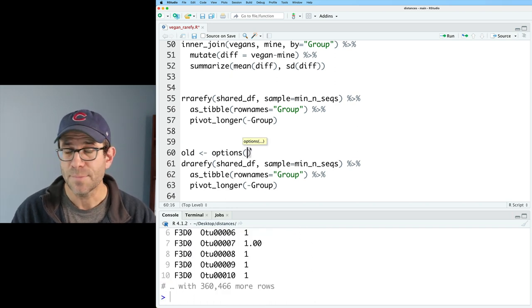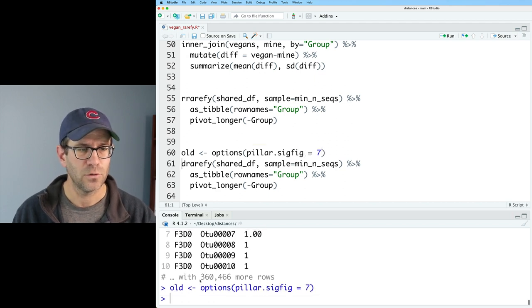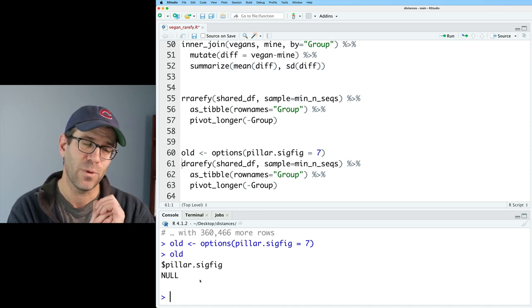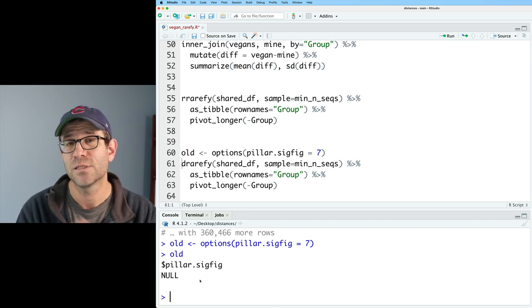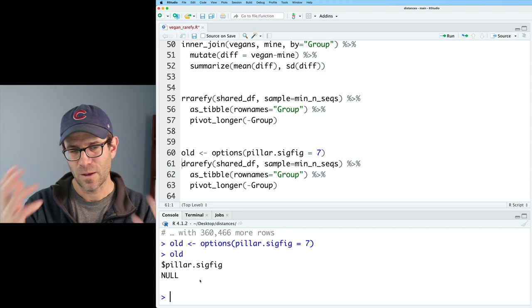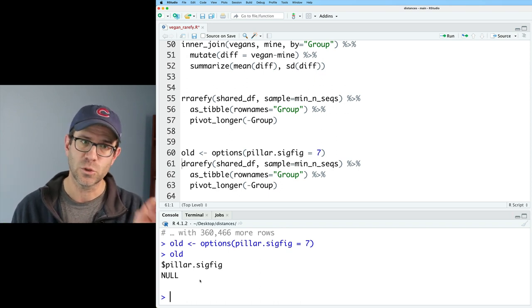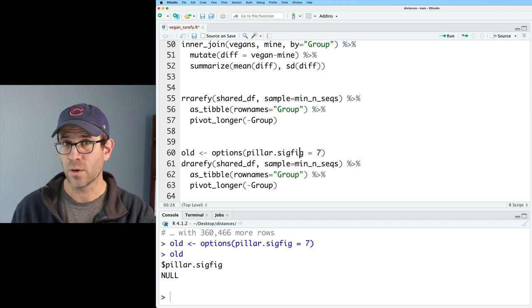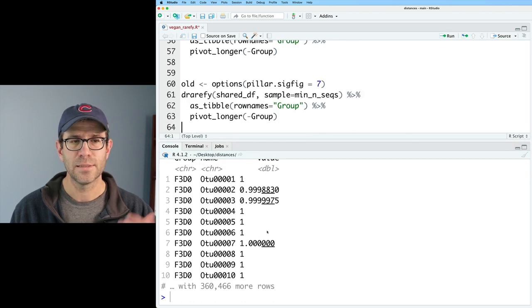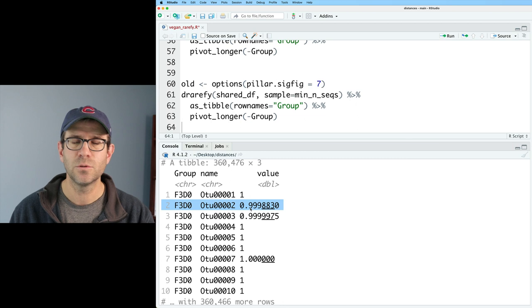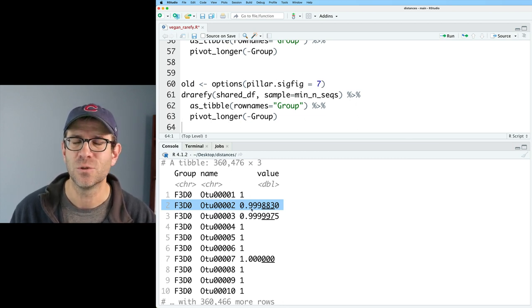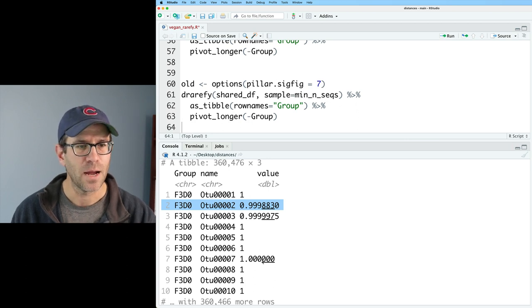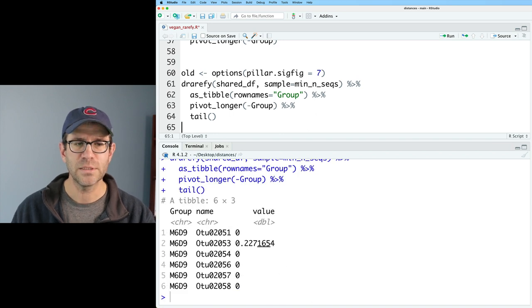If we want to increase the number of significant digits, we can alter the options for how we display values in a tibble. To do this, I'm going to say old equals options. So I can then give options pillar.sigfig equals seven. And if I look at old, I see null. And so what that means is that previously had used null, which tells pillar, which is the package that tibble uses to figure out the significant digits to use the default. So the old version was using the default. Now we are using seven significant digits to the right of the decimal place. Now when I run drarefy, I get seven significant digits, right?